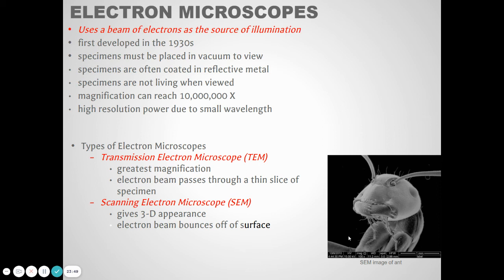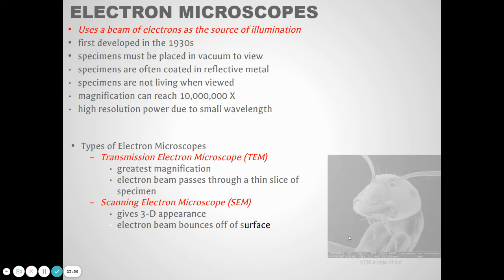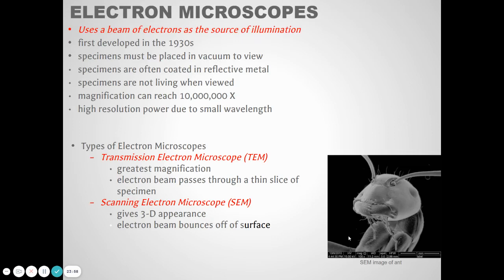It gives a three-dimensional appearance. And it can get great resolution because the electrons are so small and have such a small wavelength.